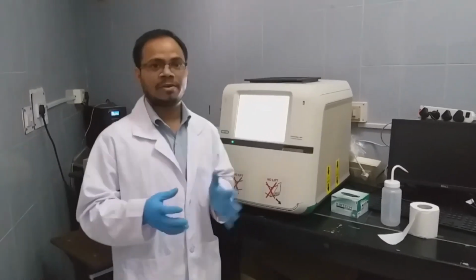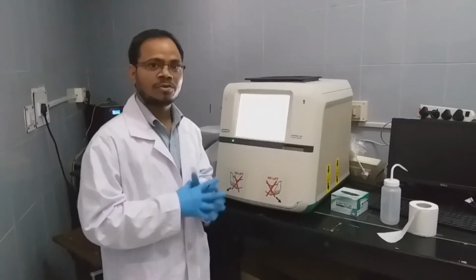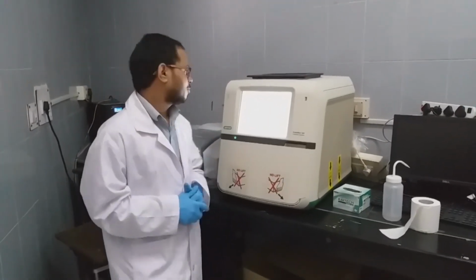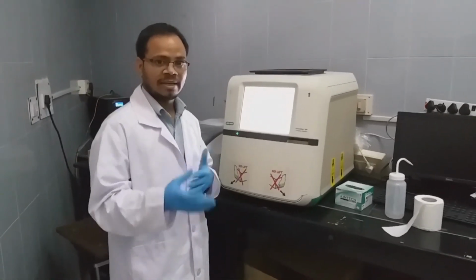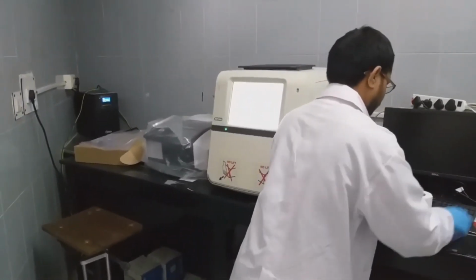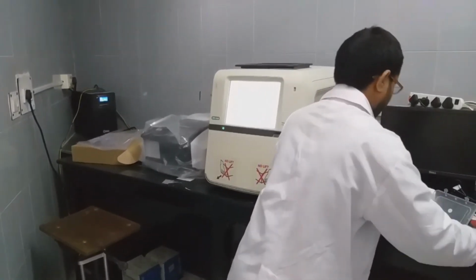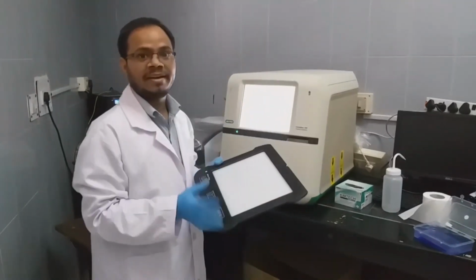We can see it manually also, but for record purposes we have to capture it through GelDoc. So this is the GelDoc imaging system from Bio-Rad. I'll show you how to capture the images. Here we will use the white tray.